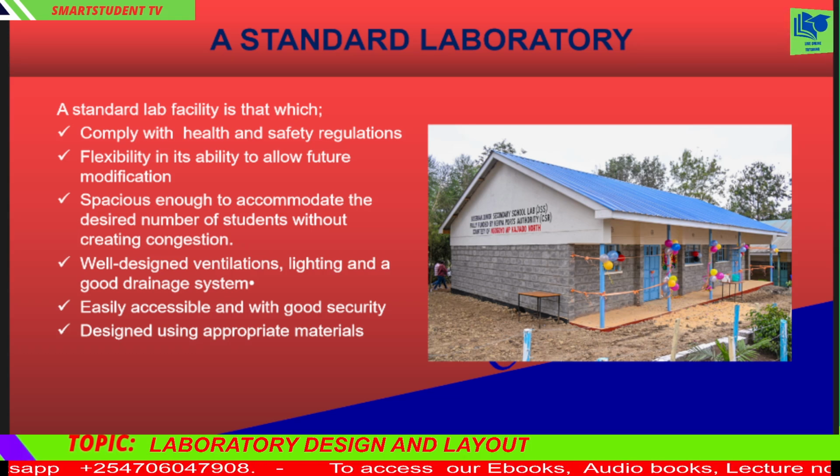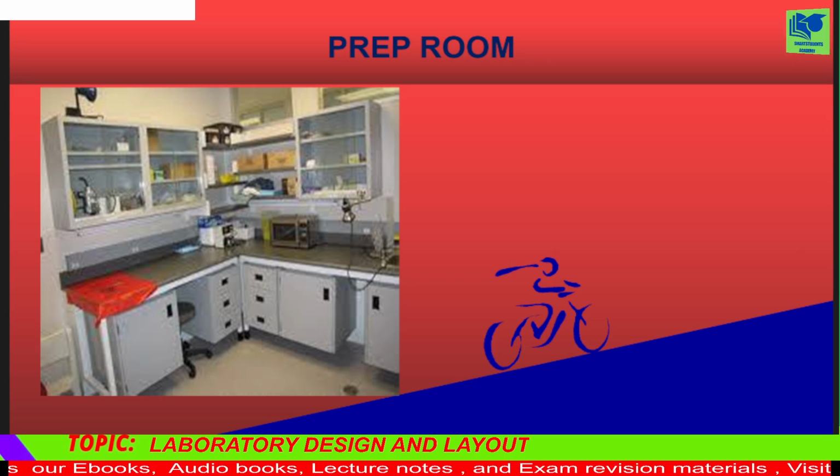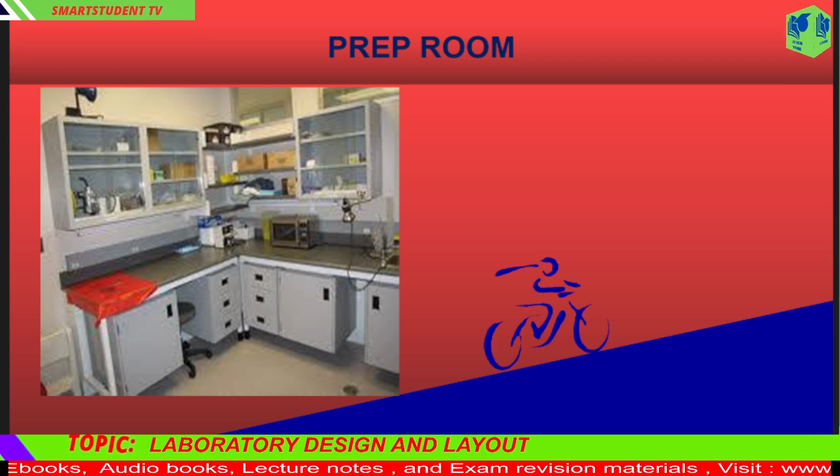What is a prep room and what features should it consist of? A prep room is a room designed to support practical work taking place in laboratories. Prep rooms are used for the preparation, maintenance, and repair of equipment and materials, and for the disposal of materials when they are finished with.